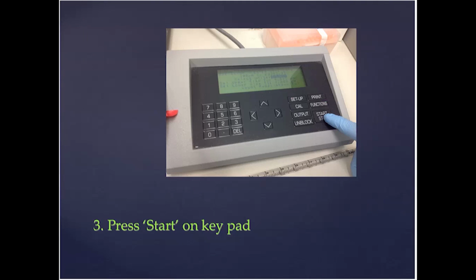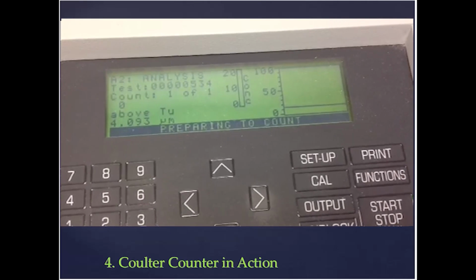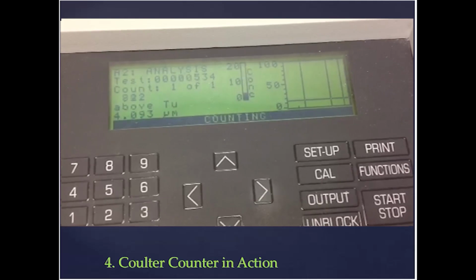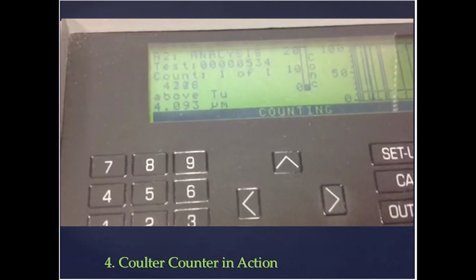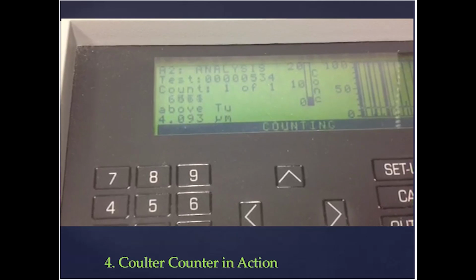and press start on a keypad. The keypad is attached next to the Coulter counter, and from there you can do all the functions necessary to do the cell counts. Again, I have a video that shows you first the vacuum is built, then the machine gets ready to prepare. Then you see the counting performed. You can see the numbers here going up as each cell or each particle is passing through the aperture.